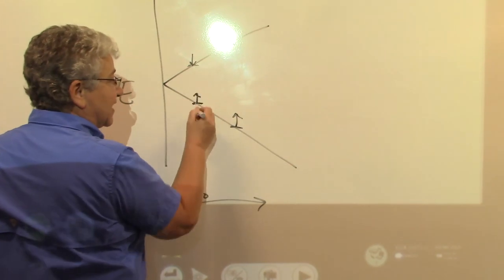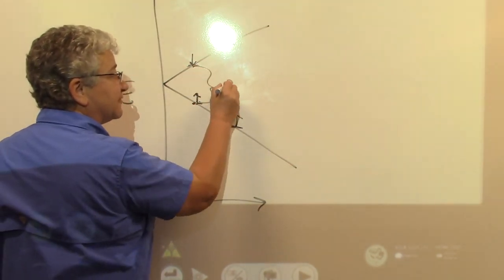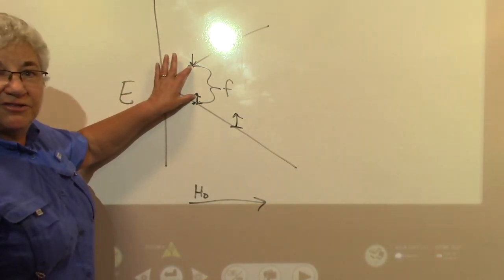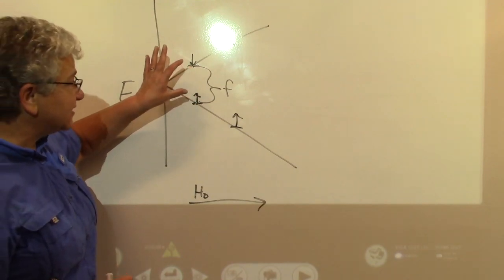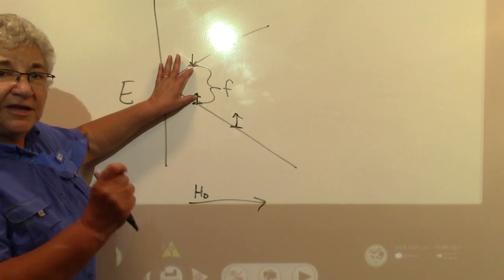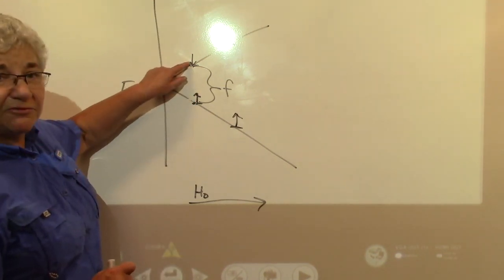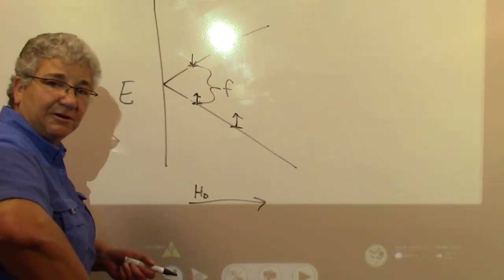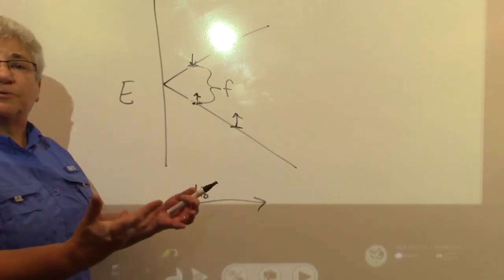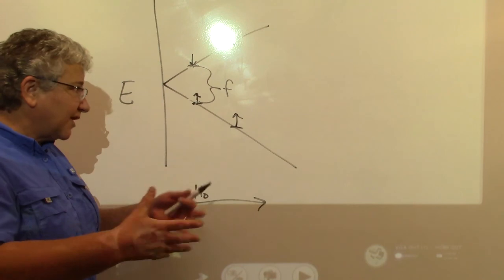And so, try to stay on screen, right? If my atom has this energy gap, that's a very specific frequency, a very set amount of energy. And so there's one radio frequency that is that amount of energy. And if your sample is hit with that frequency, it will absorb that frequency, and it will cause this atom to spin flip. It'll go from the up position to the down position, from a lower energy to a higher energy, because it absorbed that quanta of light or radiation.